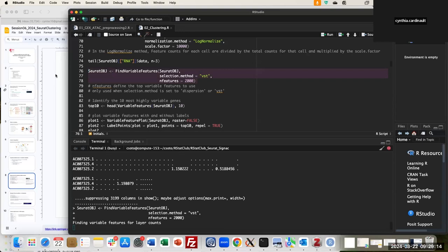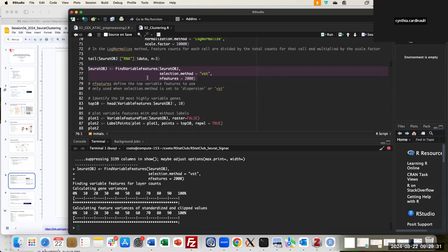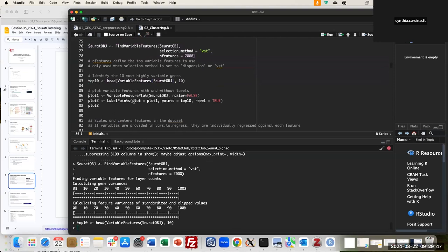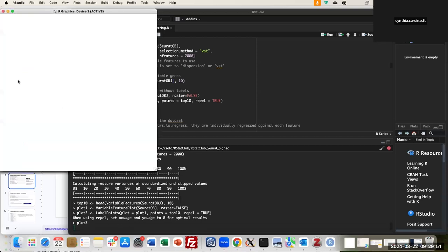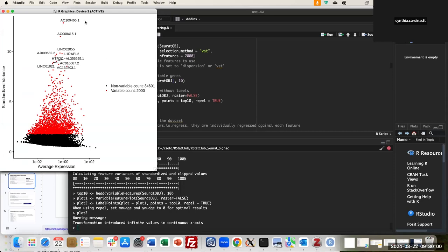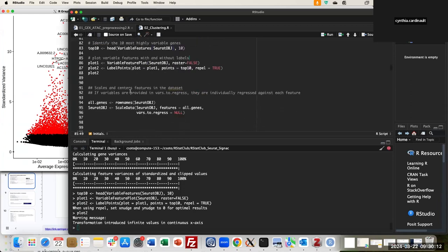Running this function will first calculate the gene variance, then calculate the standardized feature variance and clip the values. These options exist as parameters to adjust the function. I will look at the head of the variable features and catch the first 10 elements. We have labeled the 10 most variable features according to the parameters we ran.